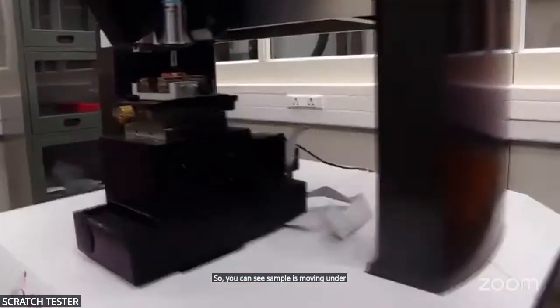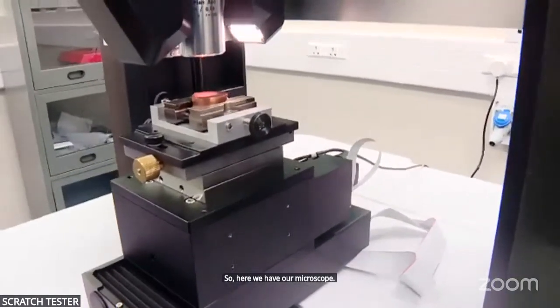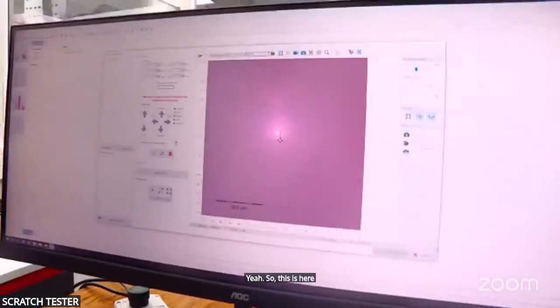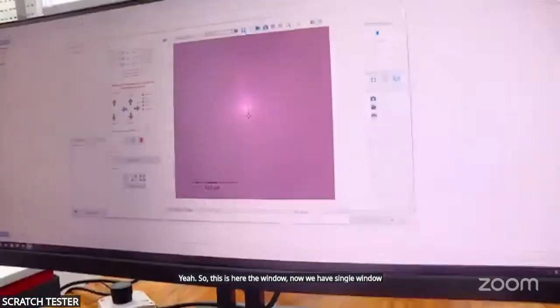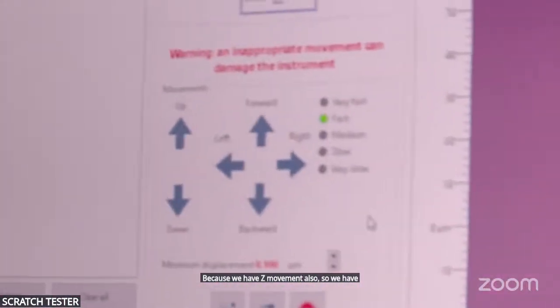You can see the sample is moving under the microscope. So here we have our microscope. This is our digital microscope that I told you about. This is the window. Now we have a single window, left and right again, because we also have Z movement. So we now have movement along up and down.